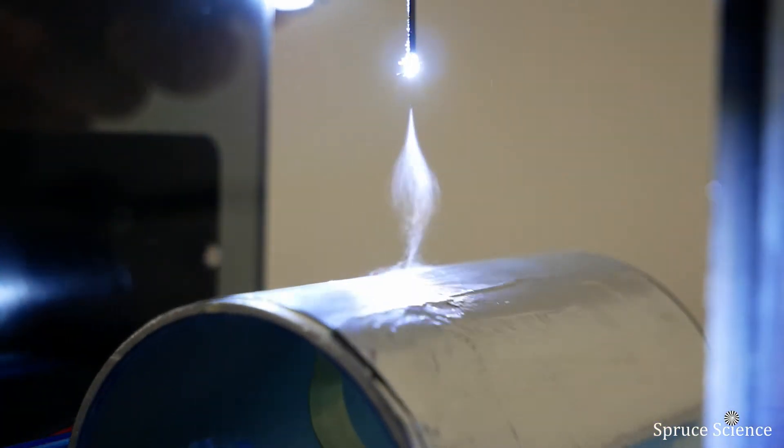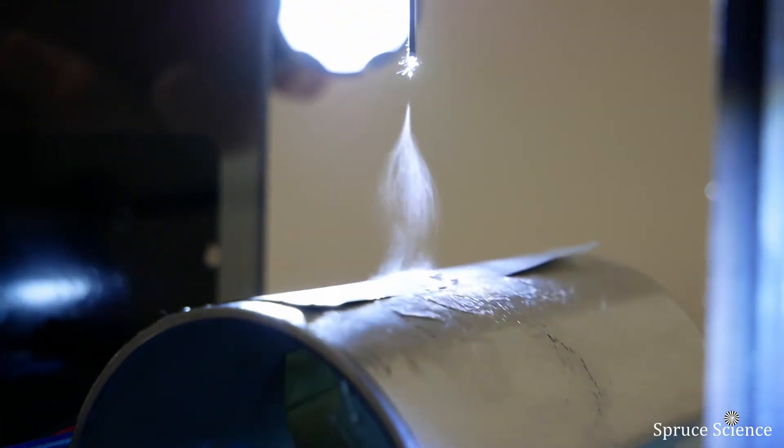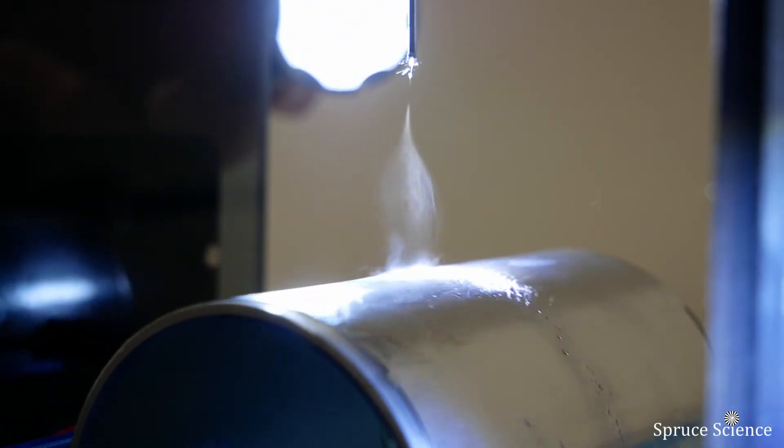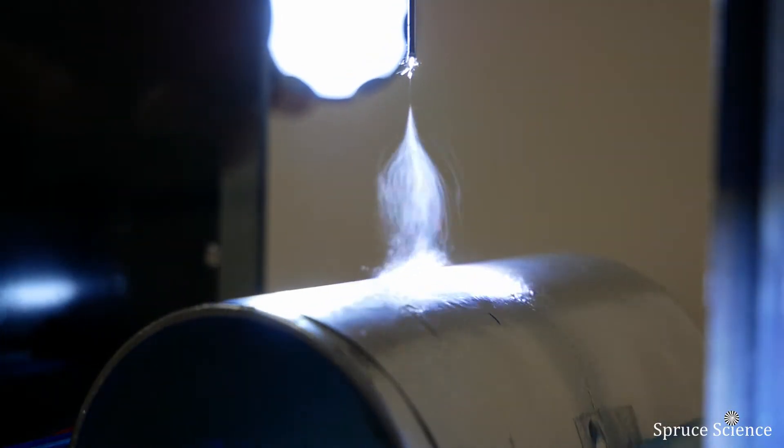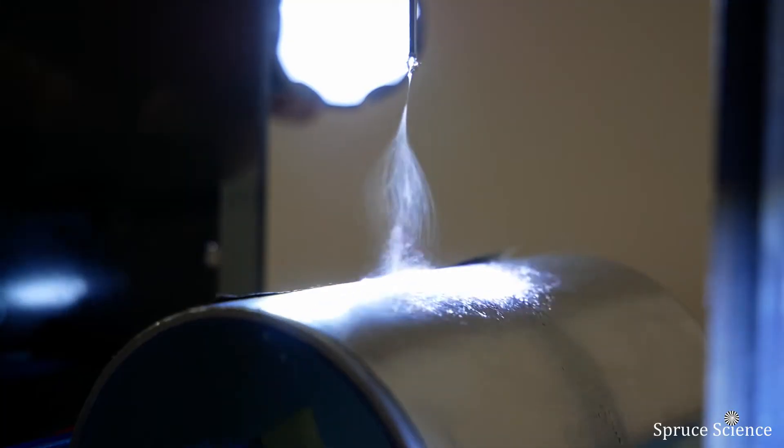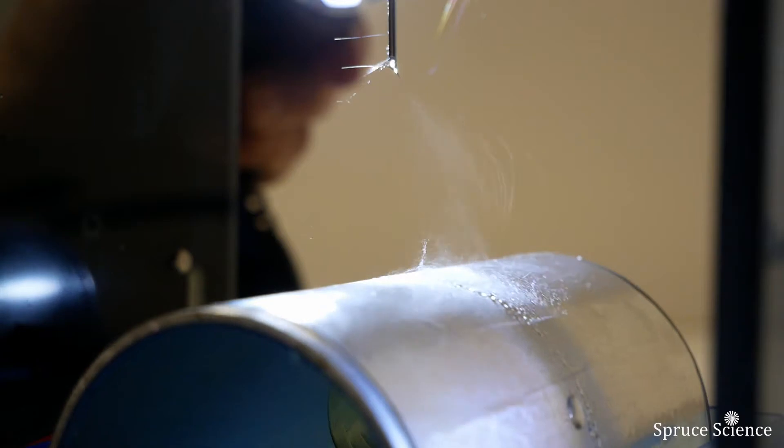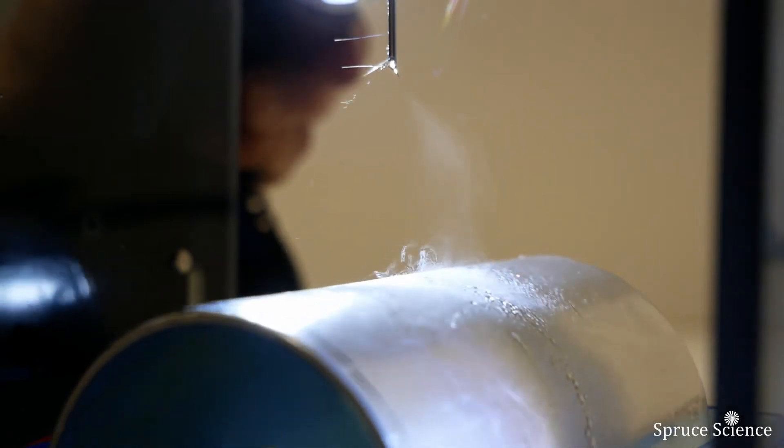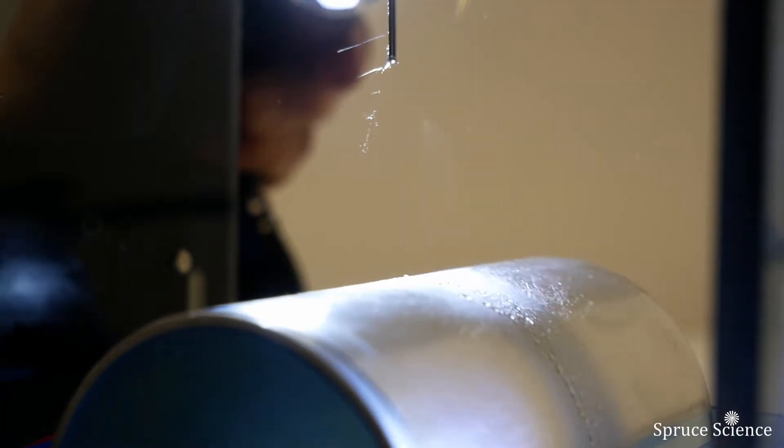A high voltage power supply is used to create a charged jet of polymer solution. When this jet travels in air, the solvent evaporates and leaves behind a charged fiber. Because of the intense electric field that exists between the needle tip and rotating collector, the fibers are electrostatically elongated and collected on the metal sheet.